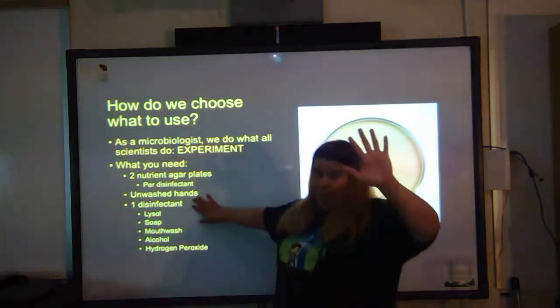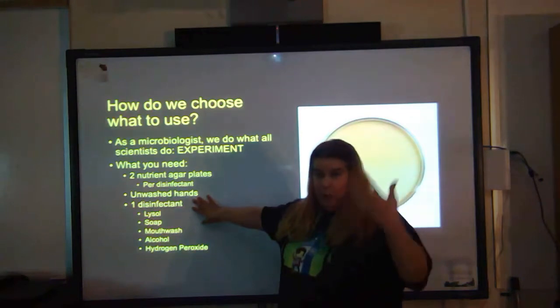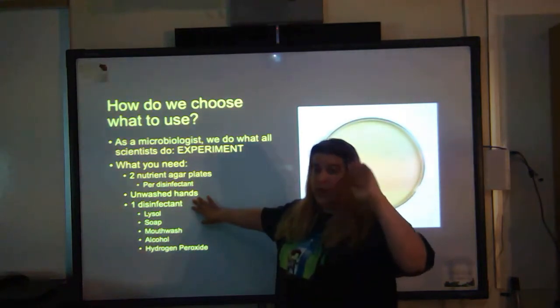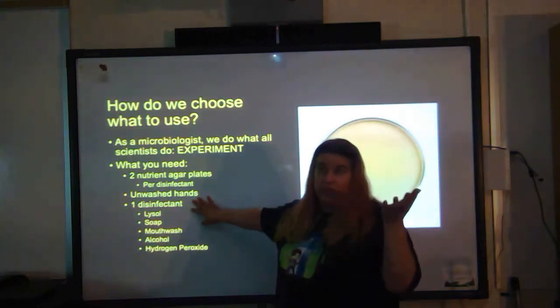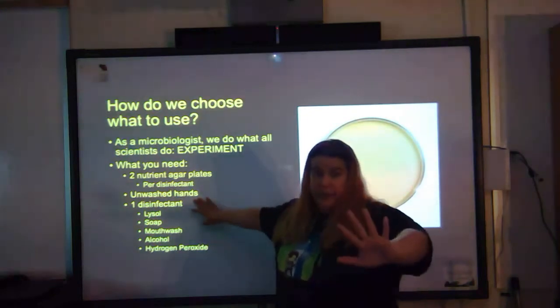You need a set of unwashed hands. Most of the time when we walk into the micro lab, the first thing we do is we grab a set of gloves and we use Clorox wipes on the table, and then depending on which student it is, wash your hands. In this case, I don't want anybody washing their hands yet.